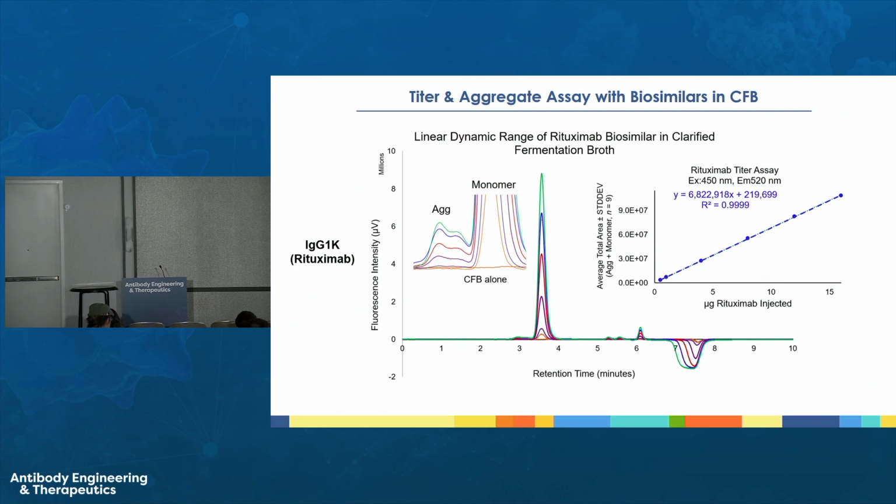And you can see that if you inject different amounts, you get a nice linear curve. And this is, again, a very distinguishing feature of this assay, because I don't know how many of you have done immunoassays, but if you do a binding assay, even SPR or ELISAs, you get a sigmoidal curve. In this one, the curve is linear because the analyte is always moving into a fixed concentration of the molecular recognition agent. It cannot fall off. It only has to go in one way.